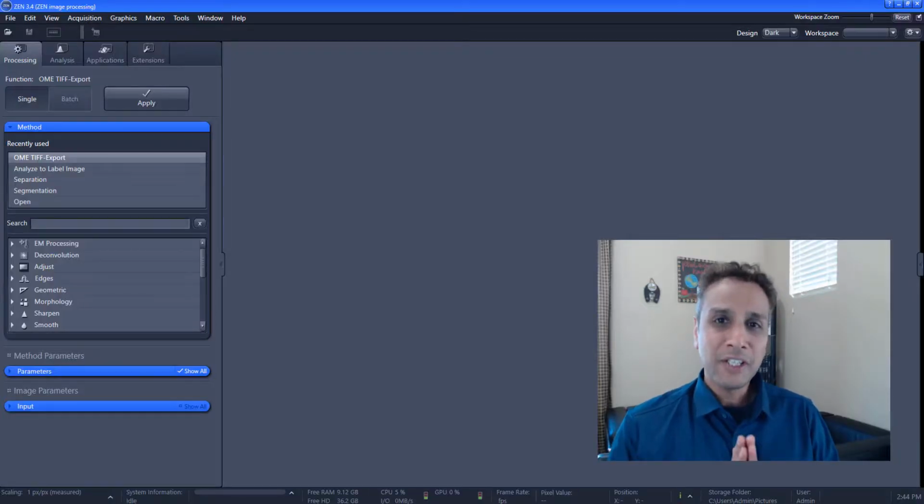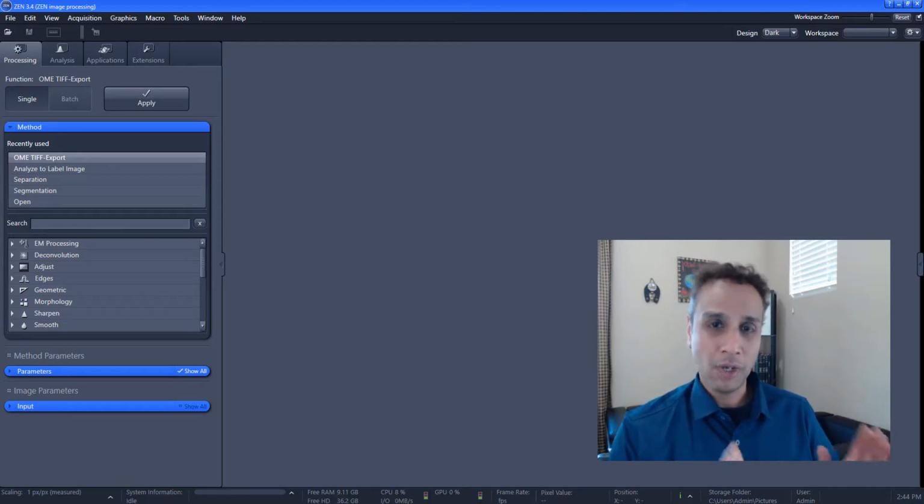Hi everyone. In this video, I'm going to show you how you can perform object tracking in ZEN using a module from APEER, which is the online cloud platform. And this module on APEER is called blob tracking. It's designed to track segmented objects as a function of time and generate some reports. And we're going to see the process here.